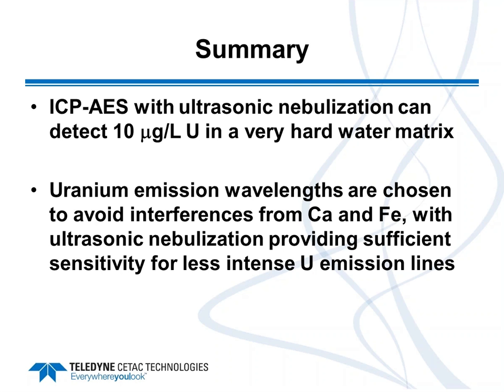So if you had a very clean matrix and an area of the ICP mass spectrum which is very clean, particularly at high mass, in general you might be able to see a factor of up to 10-fold improvement, again depending upon how low the blanks are. And that's going out into the area where you would have rare earth elements, platinum group elements, and actinides.